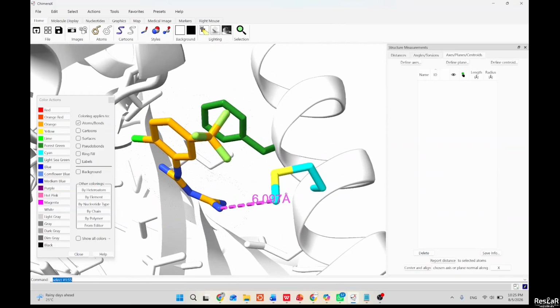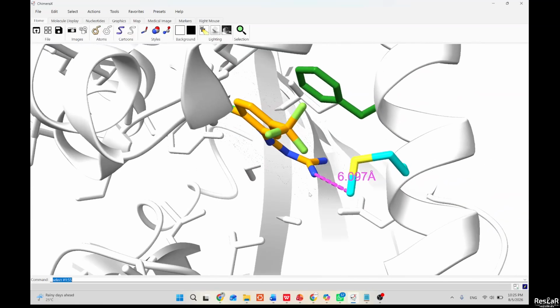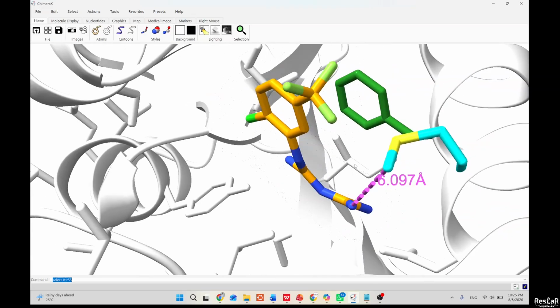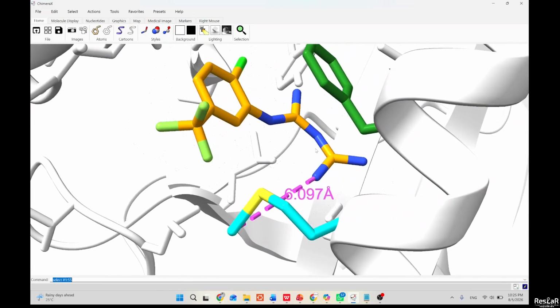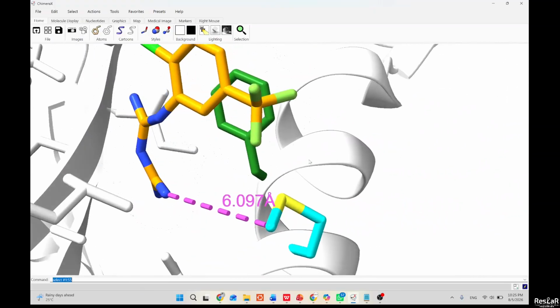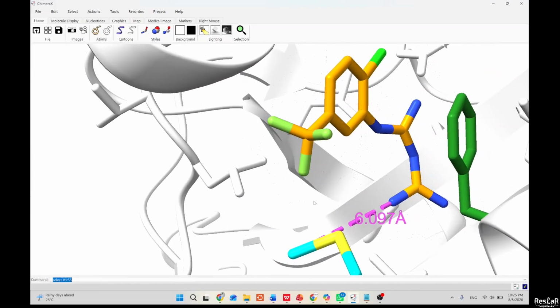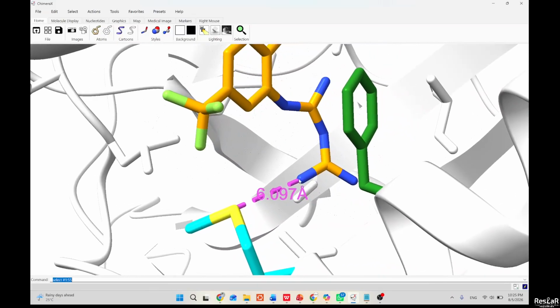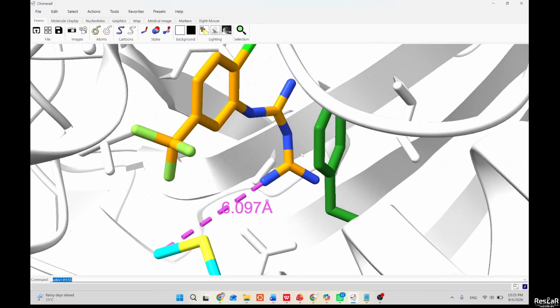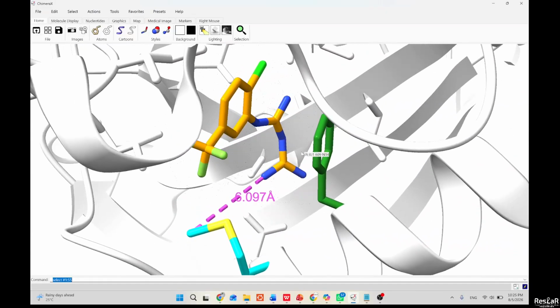So once you are done this way, what are other things that are available to you? Let's assume I've depicted the structure I want, I've calculated the distance that is most important to me, and I can see the distance. What do I now do? I will need to maybe rotate this until it comes very close to what I want, I mean the representation, the side I want to see. So let's assume this is fine for me, and then I will go ahead and save this out.